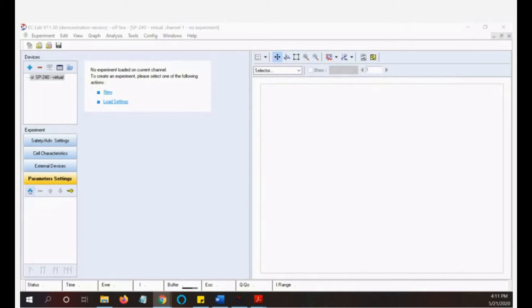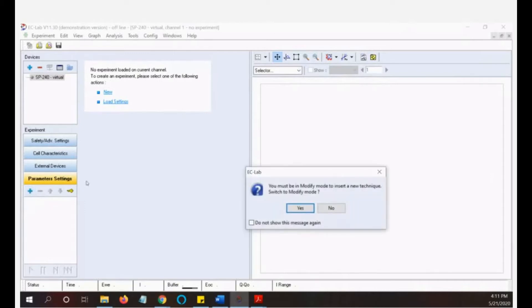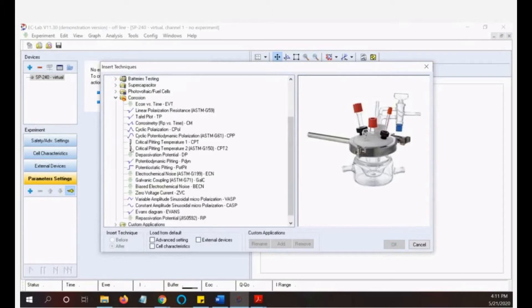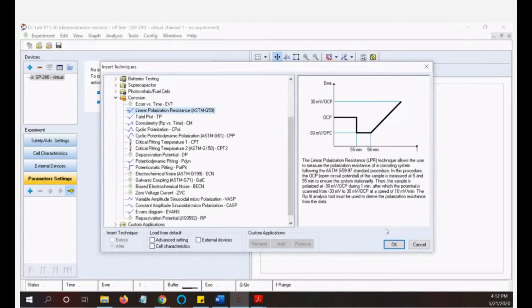The experiment we want to use is called Linear Polarization Resistance. This is our EasLab software. For corrosion analysis, we go under the electrochemical application, select corrosion, and then choose the method Linear Polarization Resistance. Then click OK.